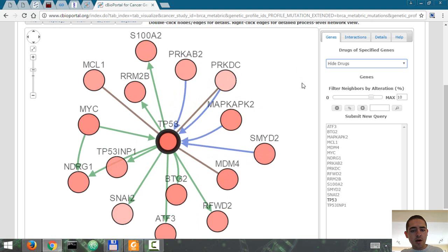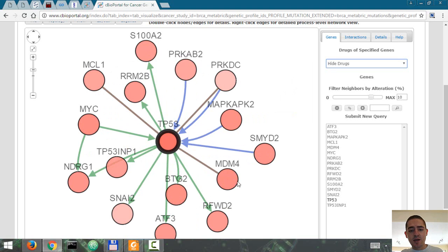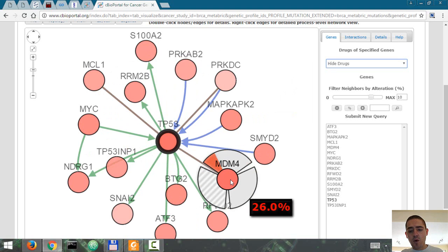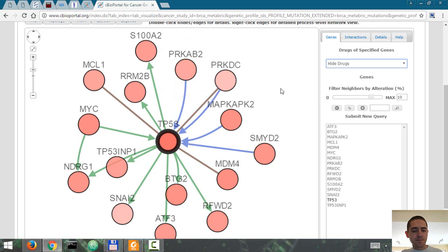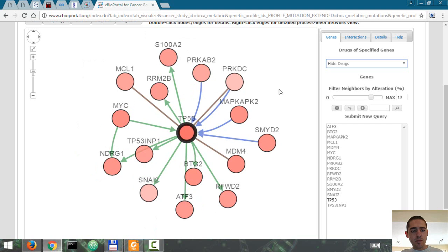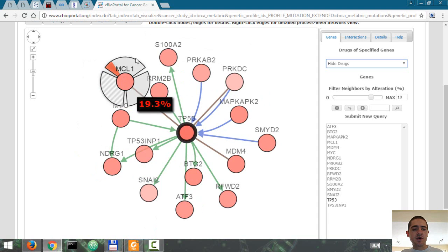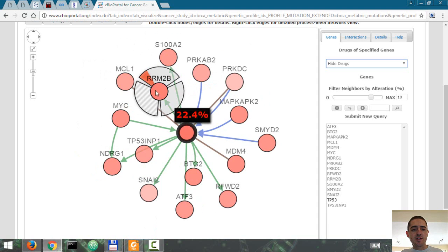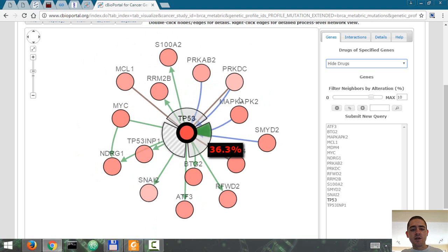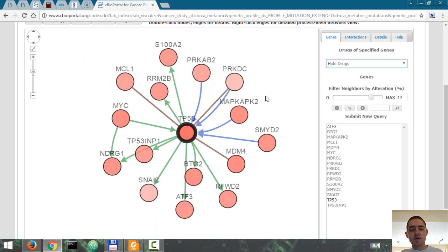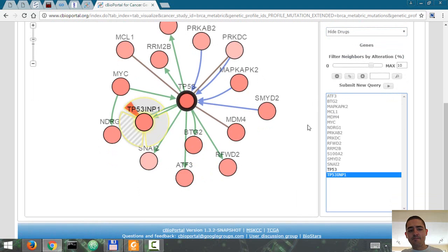Others that are highly mutated are MYC 26%, MDM4, and PRKAB. You can see the different shades suggesting how mutated each of these genes are. And also you have a list of them right here.